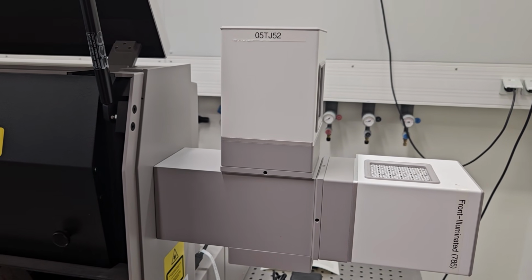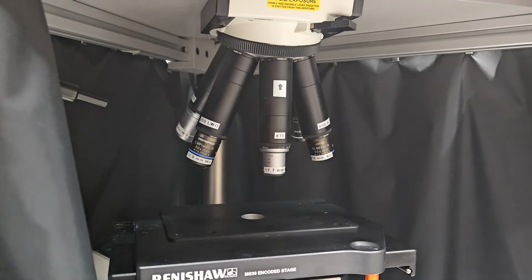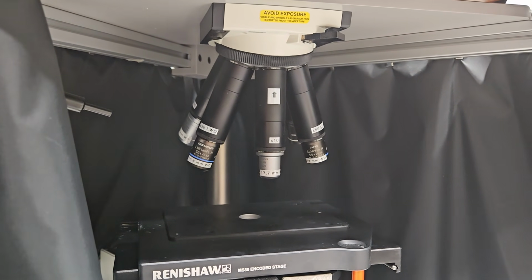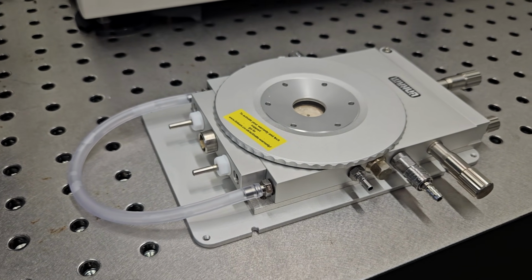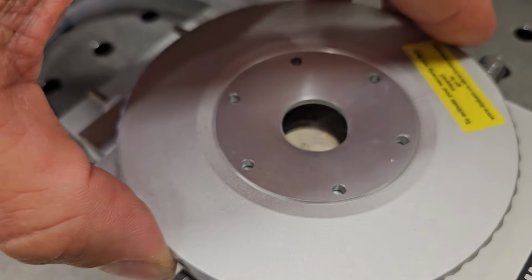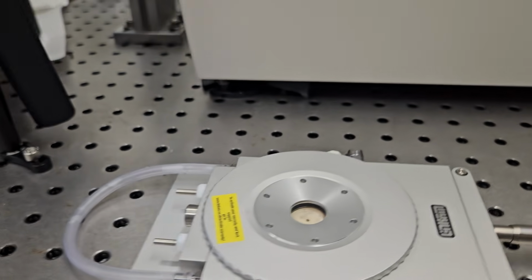The sample you want to measure goes on this stage. And what can you put on as a sample? Actually, anything. Liquids, gases, solids. Maximum height is about the width of your hand. And you can also use a plate like this to heat or cool your samples during the measurement. To do this, the sample is placed in there and then screwed shut. This means that you can also fill this chamber with inert gas or measure it at a certain humidity.